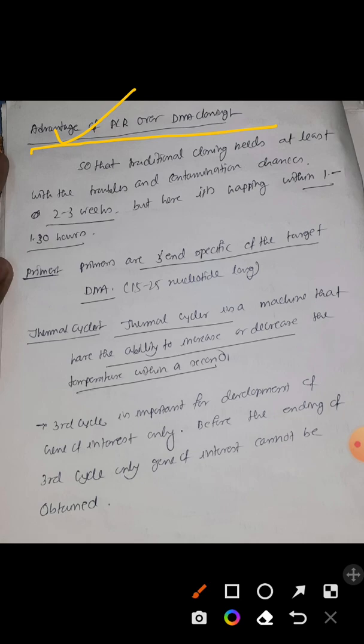Why is PCR advantageous over DNA cloning? I am also going to discuss the disadvantages of PCR. Remember that a traditional DNA cloning procedure, with all the troubles and contamination, takes 2 to 3 weeks to complete, right?